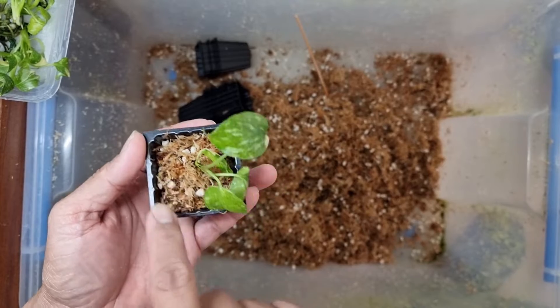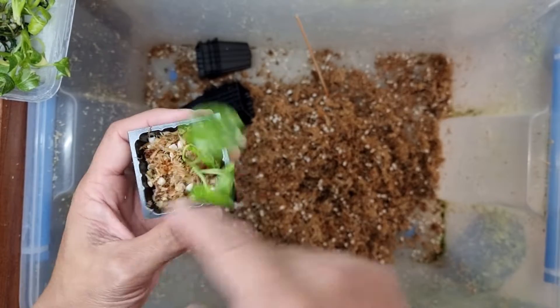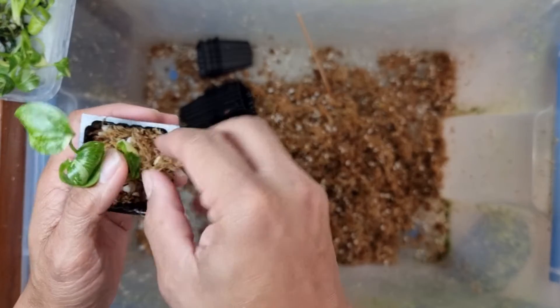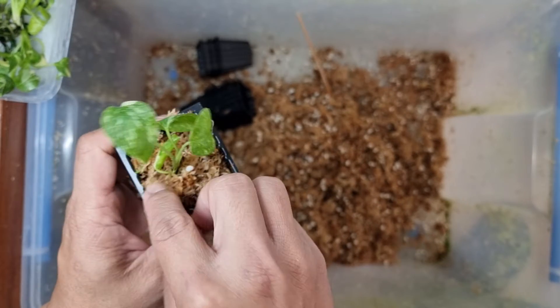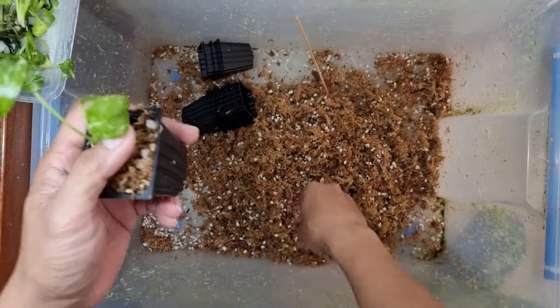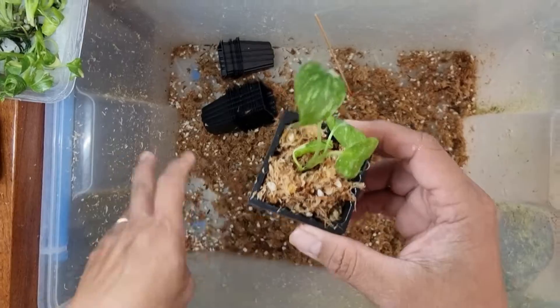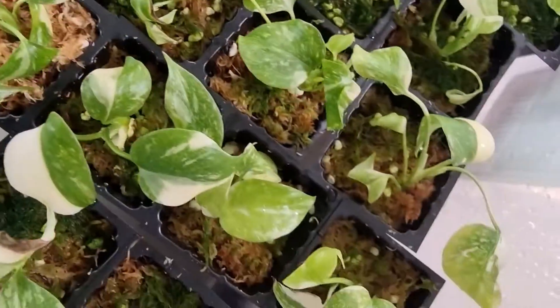I just pat it - I don't push it down because pushing it down will break the very fragile roots of this plant. Once it's planted, I top up a little bit at the top so they have enough media in there.